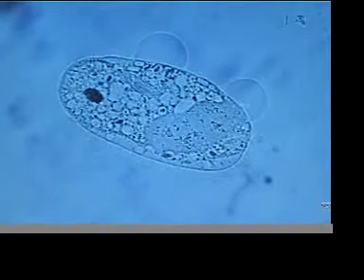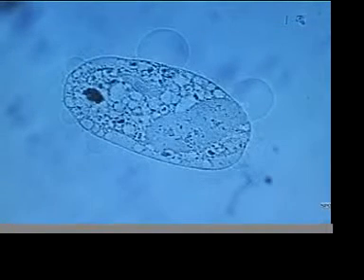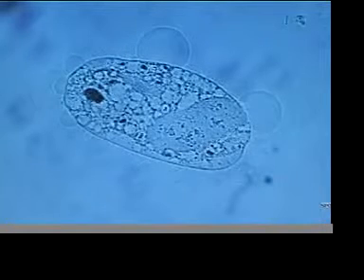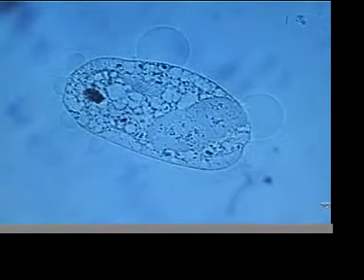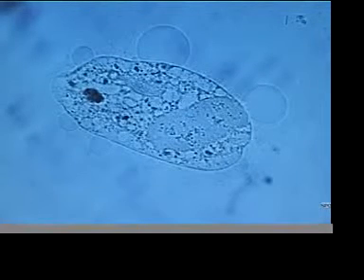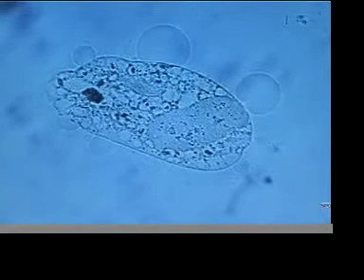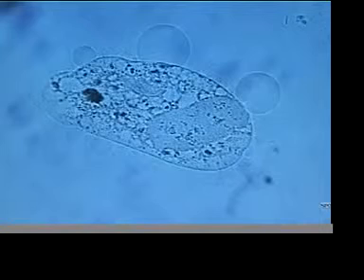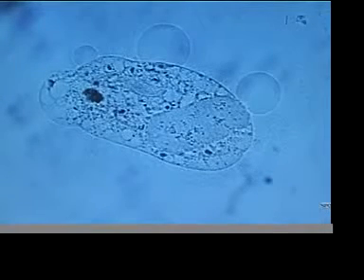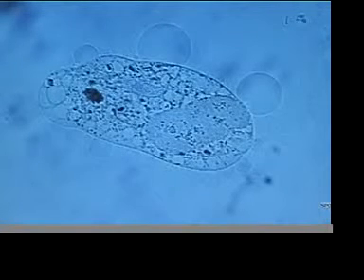Another blister forming, several along the bottom. Oh, here we go. Total destruction of the paramecium. Tremendous structural changes happening inside, openings in the cell membranes. Notice as the contents are released, the formation of the spheres. Now internal structure really completely destroyed in a paramecium.